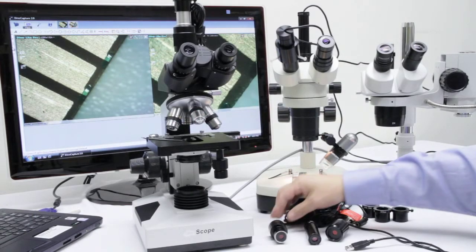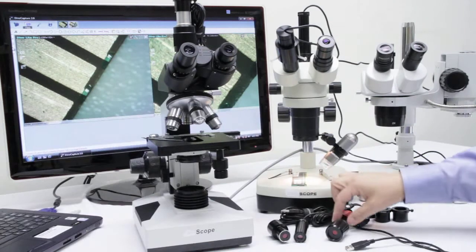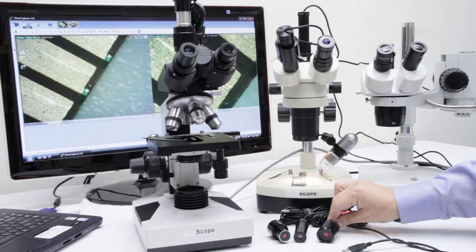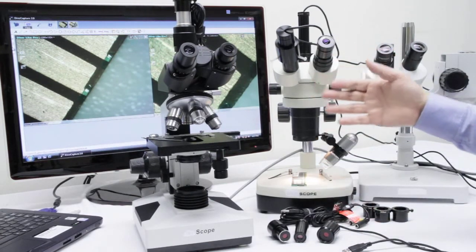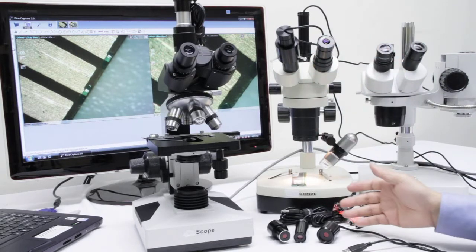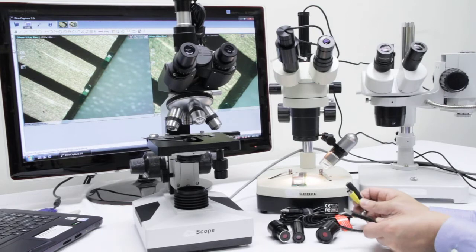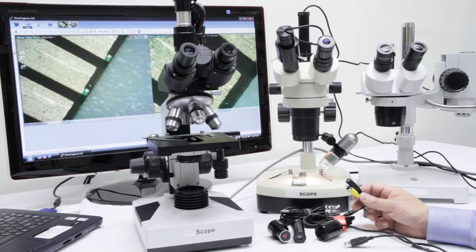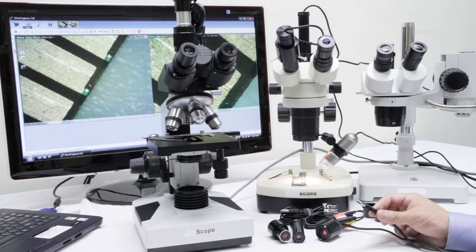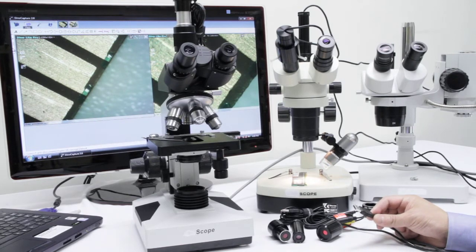Here we have the AM423, AM423X, AM423C, and the AM423U - four different model eyepiece cameras with two types of outputs: USB or analog that can connect directly to a TV for live viewing, or USB to connect to a PC to capture images and video.